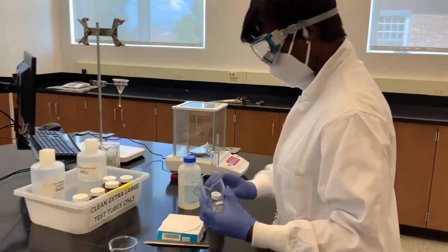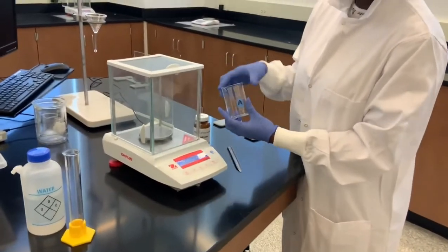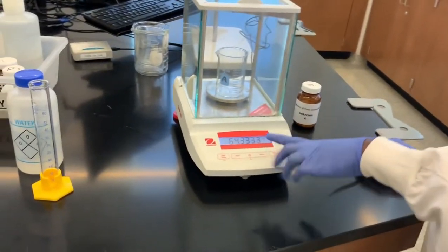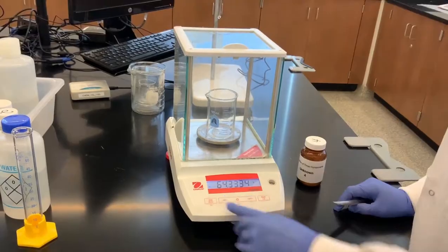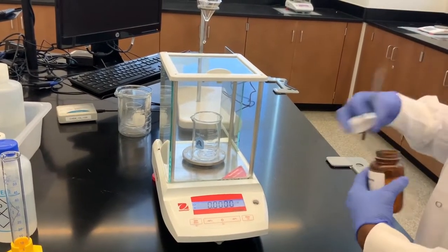So let's do this. I come back to my analytical balance. I need to measure the beaker by itself, and let's start. So it's set to 0. Now I can measure my mass, which is about 3 grams.